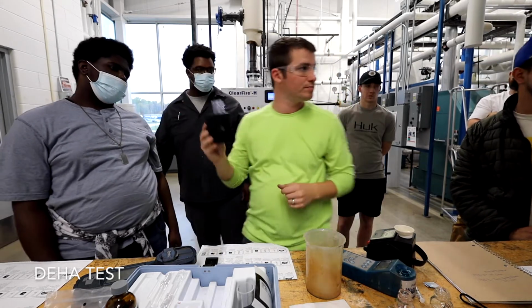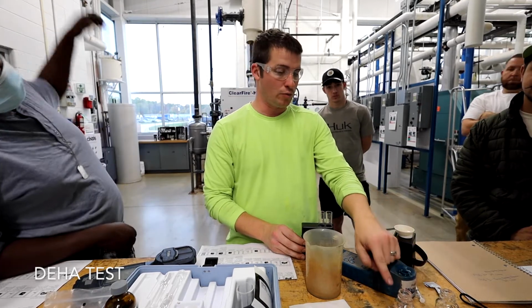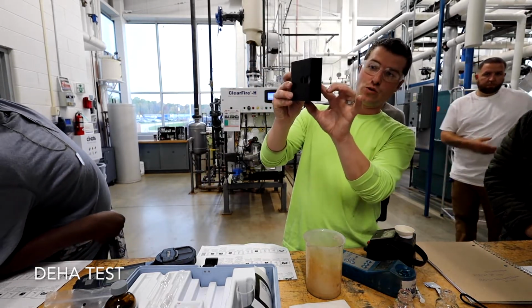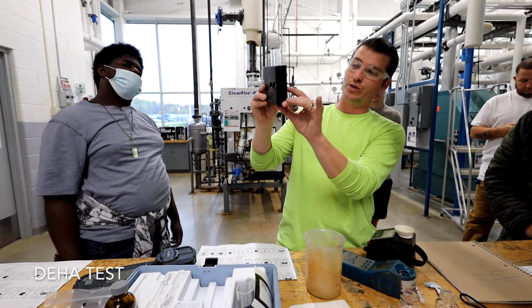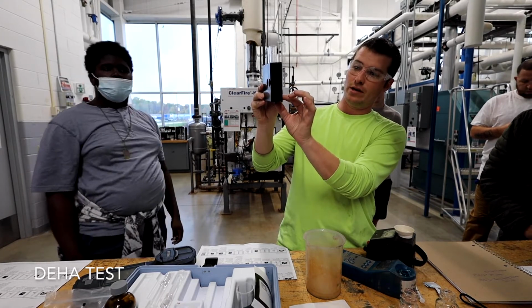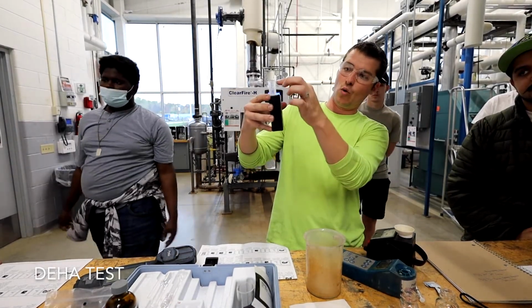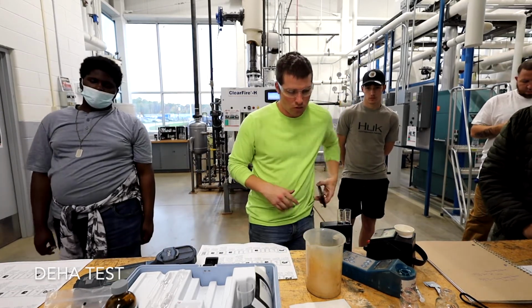So why would you need a wheel to make it turn purple? Because the blank is clear, and how we tell what this level of purple means is we compare the wheel to our sample. This is our sample here that is slightly purple itself. This wheel, as I spin it, and here I'm up to 70, is a lot more purple, right? So that's why you need that wheel. The shade, correct. Okay, I see it now. So this wheel in here is going over this one. Again, if you took your sample, it's going to be low, without a doubt.